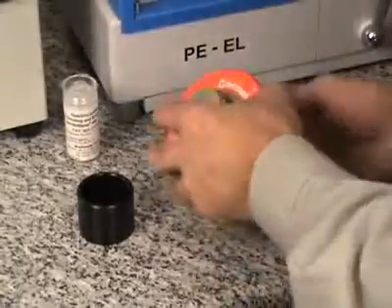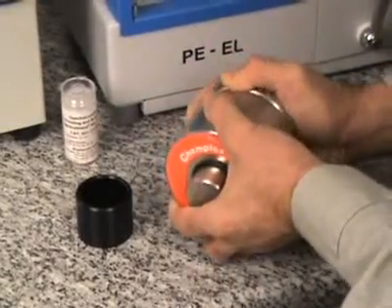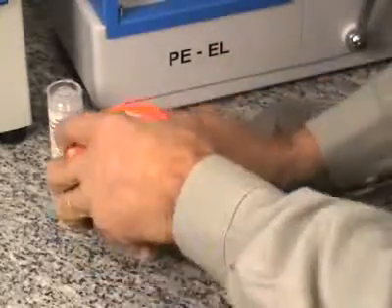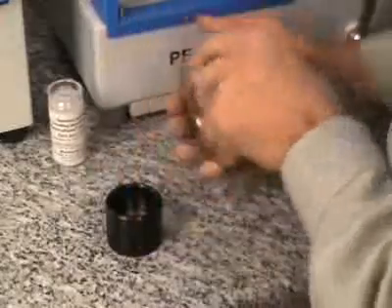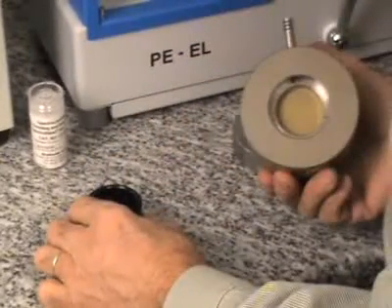The die set is removed from the press and disassembled. The base plate is taken off and the lower polished press plate is pressed into the extraction cup. You see the pallet still in the die set.